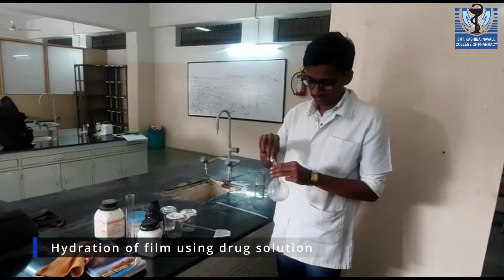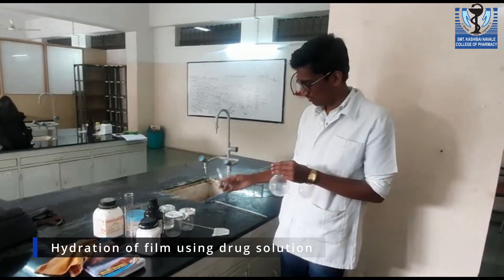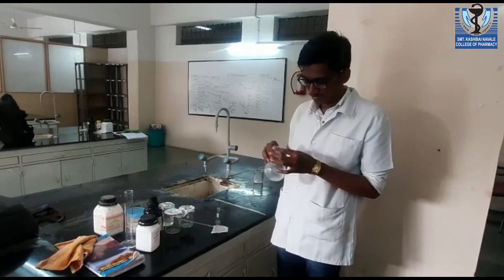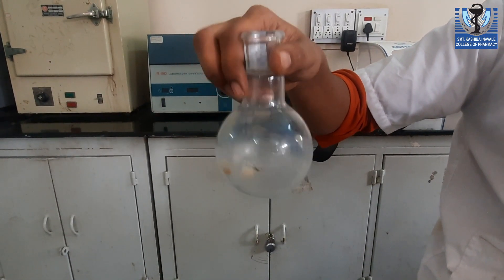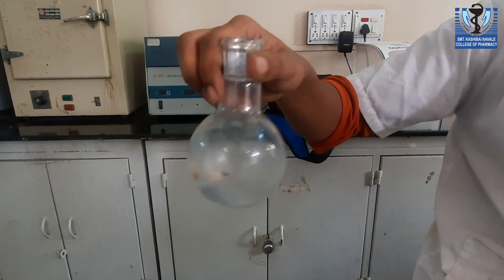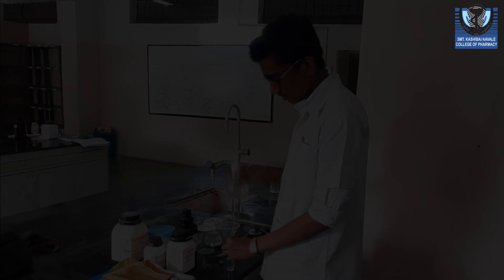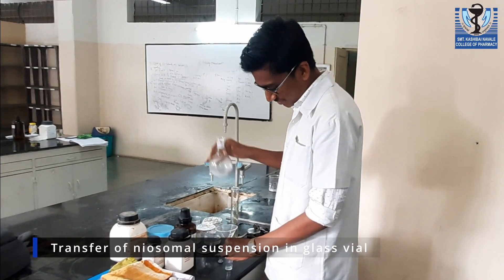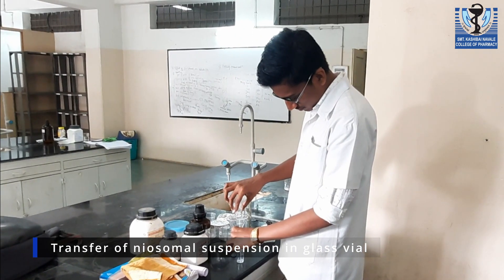The thin film is hydrated with drug solution to get niasomal suspension. The RBF is shaken for some time for the formation of niasomal vesicles. After shaking and removal of the film, the niasomal suspension is transferred to a glass vial for further procedure.